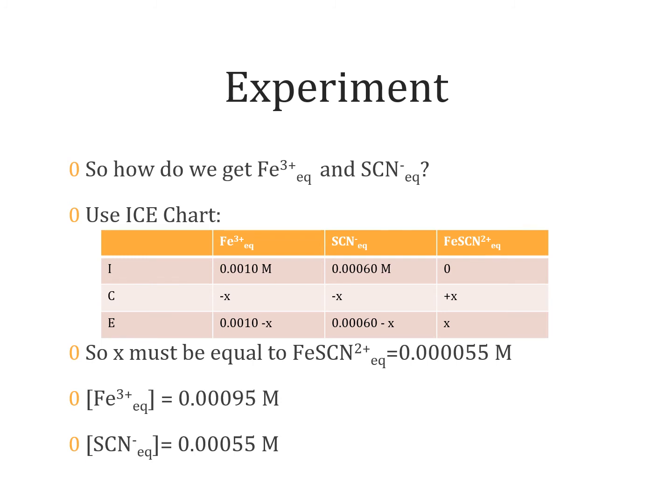I just told you, for example, you just need to subtract the initial minus the concentration of your FeSCN2+ at equilibrium, which you find by doing the concentration of the standard times the absorbance ratio for the sample and the standard, and subtracting these two will get you here. So also use run 3, for example, to help you stay on the right track.